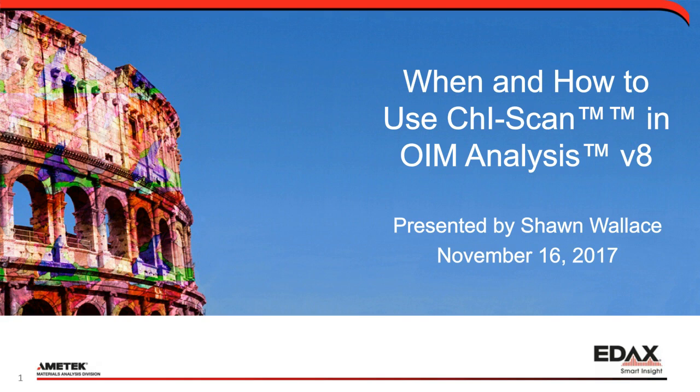So with that, we'll go ahead and start into the nuts and bolts of this webinar, which is some of the new features we've added into OIM Analysis. In this case, when and how to use ChI-Scan and all the fun tools we have built in with that.